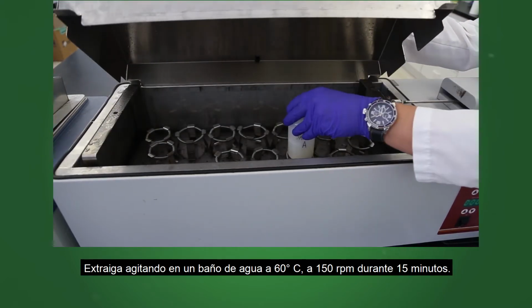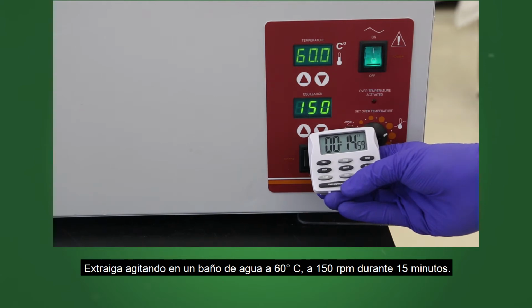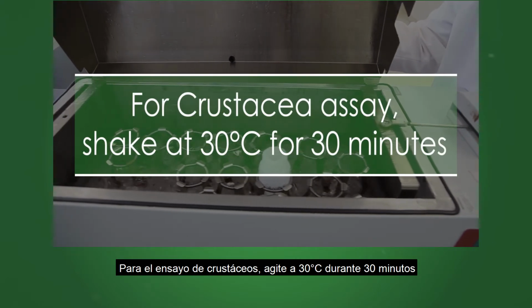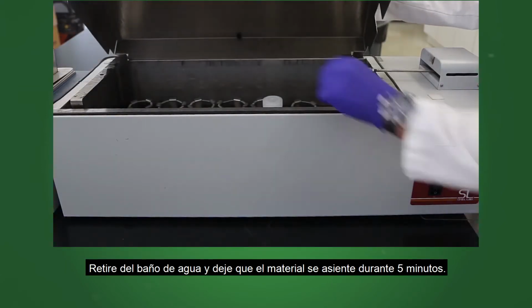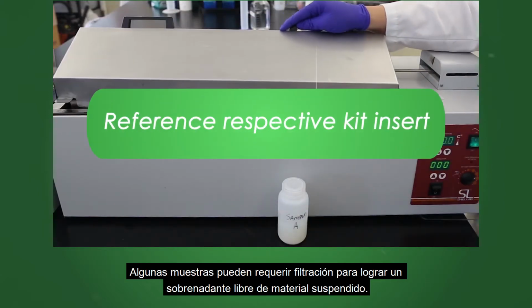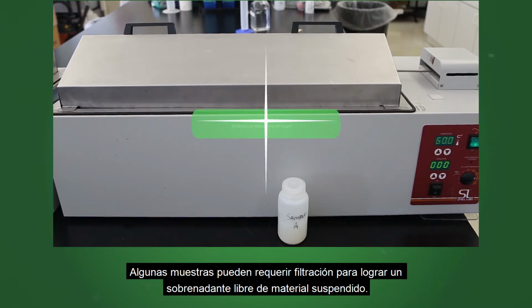Extract by shaking in a 60 degrees Celsius water bath at 150 RPM for 15 minutes. Remove from the water bath and let material settle for 5 minutes. Some samples may require filtration to achieve a supernatant free of suspended material.